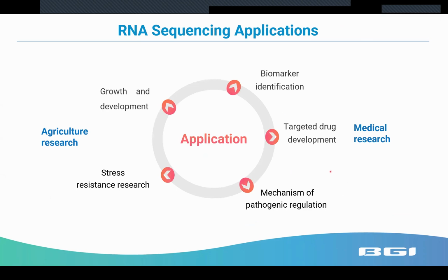For the application of RNA sequencing, it can reveal growth and development and stress resistance research for plants and animals in the agricultural area, and biomarker discovery and targeted drug development in medical research. Also, it can be used for research on the mechanism of pathogenic regulation.